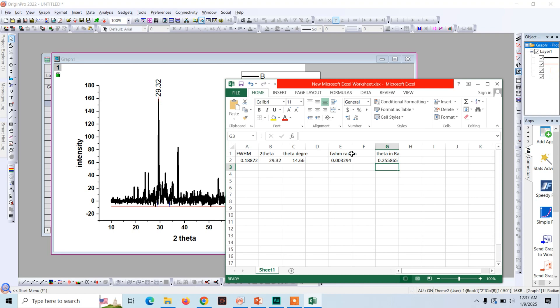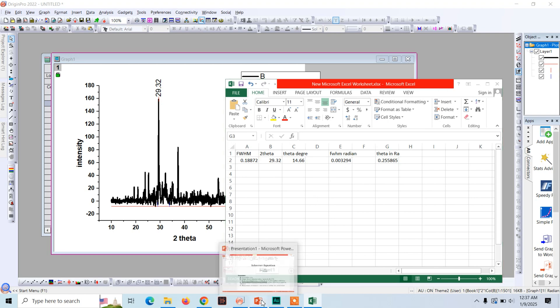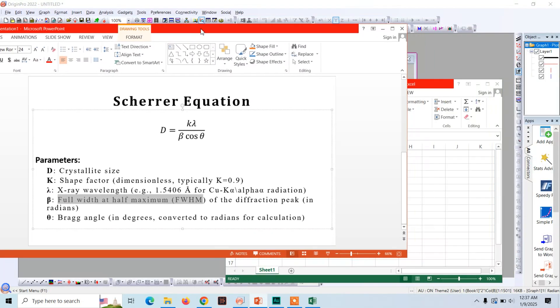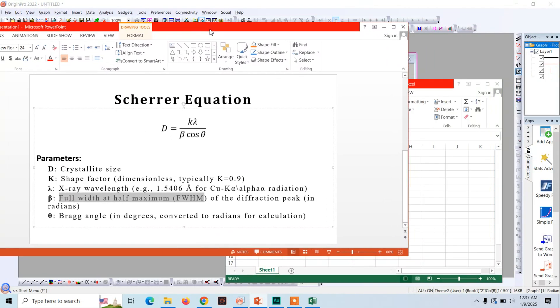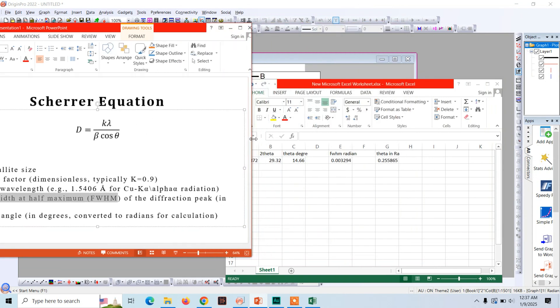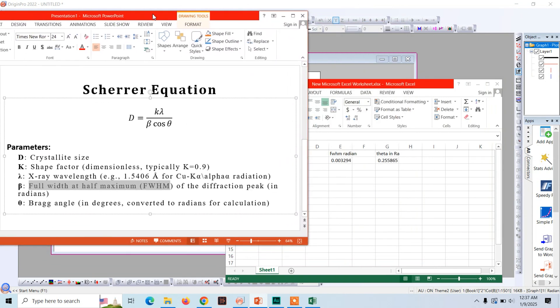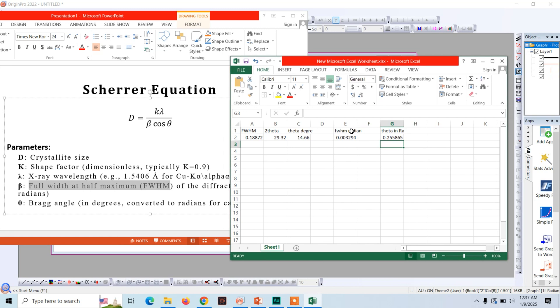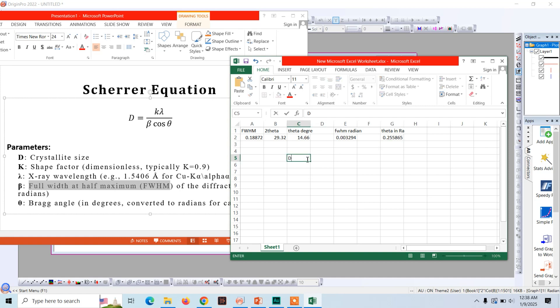Now we are going to substitute these values in Scherrer equation for calculating the crystal grain size. Here is the Scherrer equation. We have calculated the full width at half maximum, we have the value for theta, lambda, and the value for K is 0.9 and lambda is also a constant, its value is 1.5406 Angstrom. Now let's substitute these values and solve it.